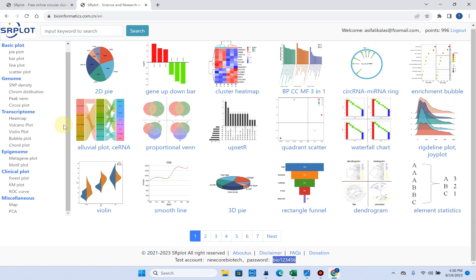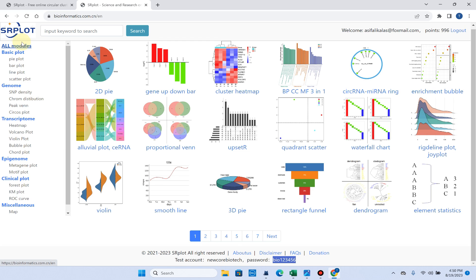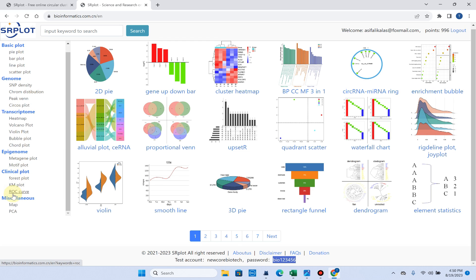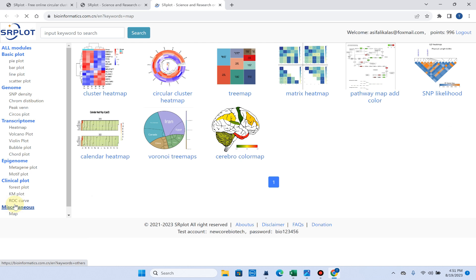So now let's move to how we can draw a circular heat map. When you click on the SRplot website, you can go to the miscellaneous tab and click on the map option.